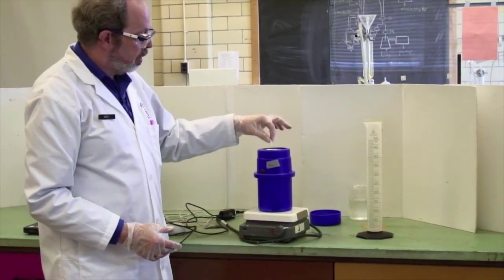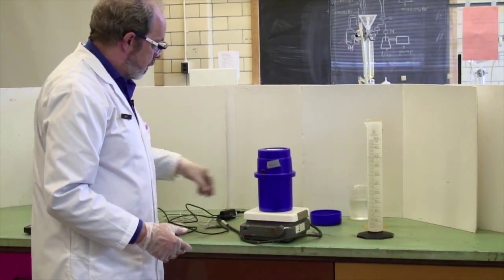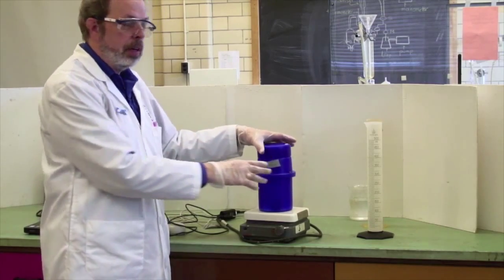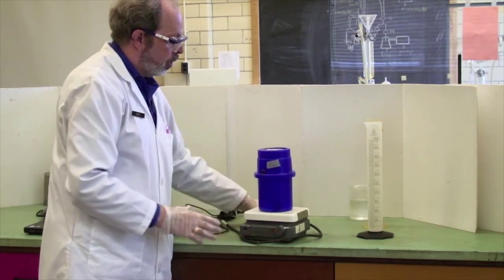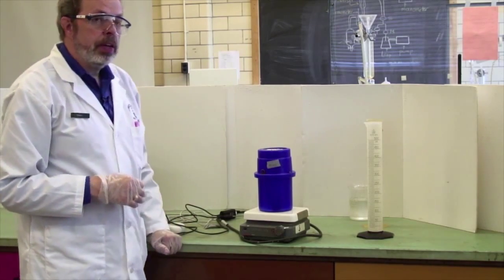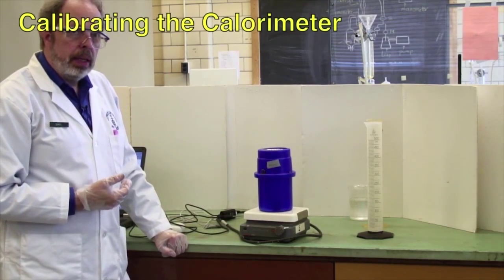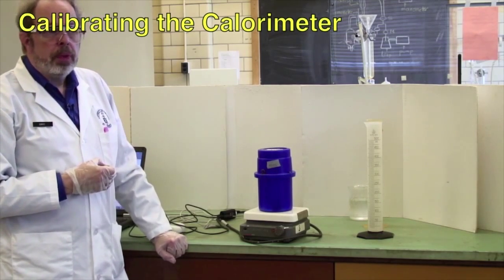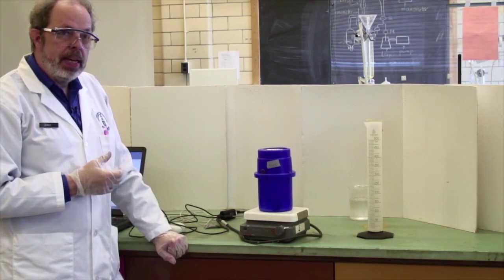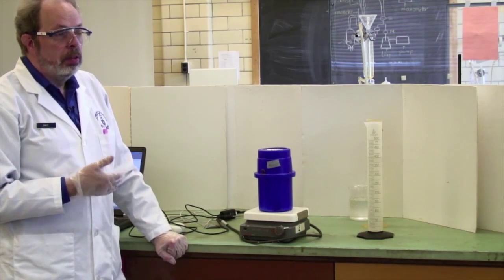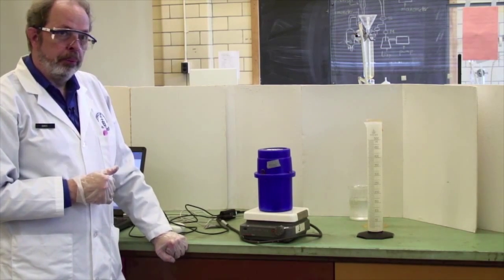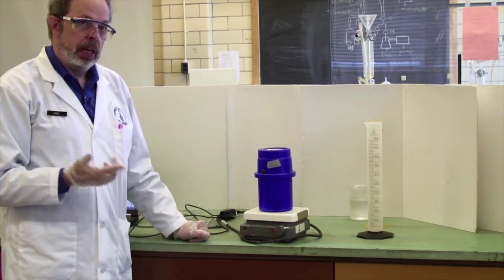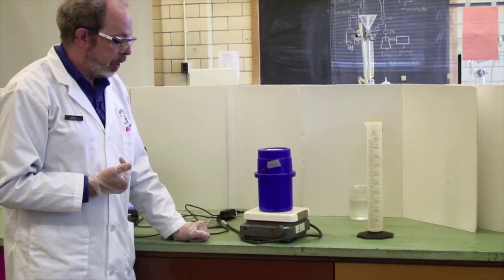The calorimeter is just a dewar flask. You should have a magnetic stir bar inside it. And when it's actually operating, we put a lid on it so that there's minimal heat loss to the environment. We're actually going to calibrate the calorimeter using hot and cold water. We know how much energy it takes to heat up a gram of water, 4.18 joules per Kelvin. However, we're not sure how much energy it takes to heat up the calorimeter. And that's what you need the calibration for.